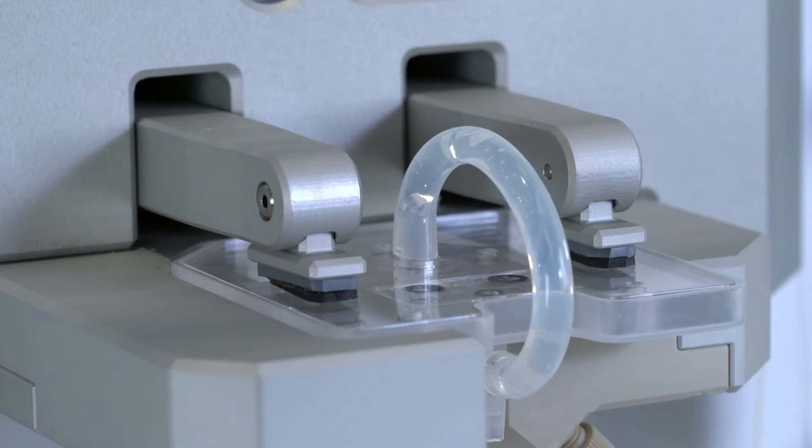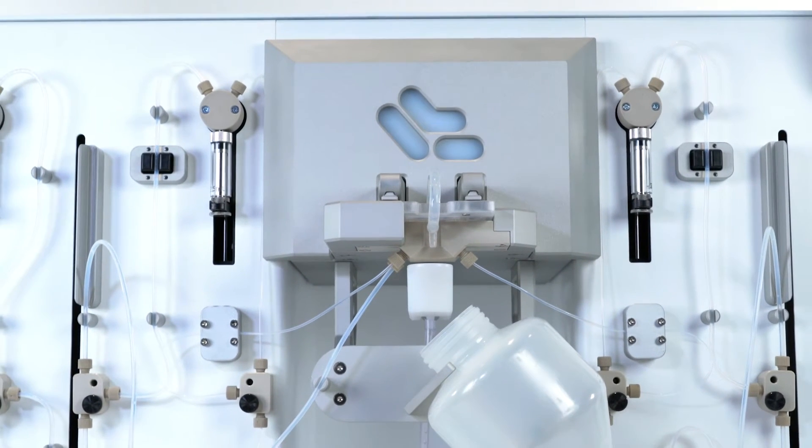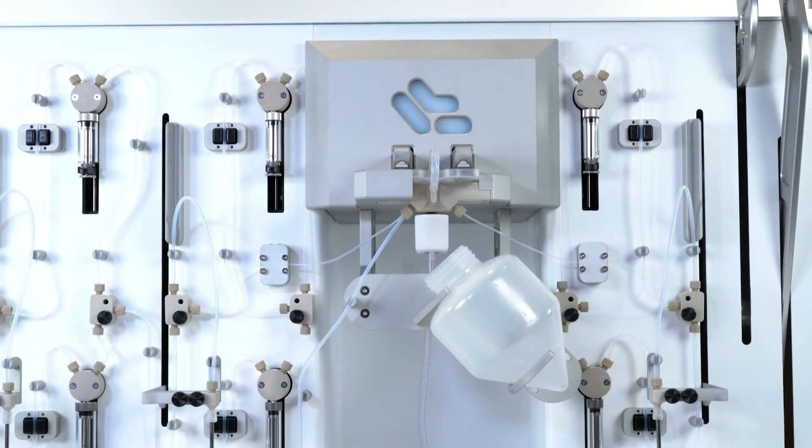Additionally, in this instrument we've added inline dilution, which allows you to, in a continuous flow format, dilute the particles after they come off the microfluidic device to test and study that part of the process as you move towards your GMP manufacturing.